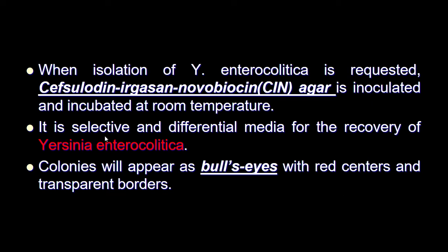So it is selective and differential: selective for those pathogens, and it differentiates even the species, like for example Yersinia enterocolitica from others.